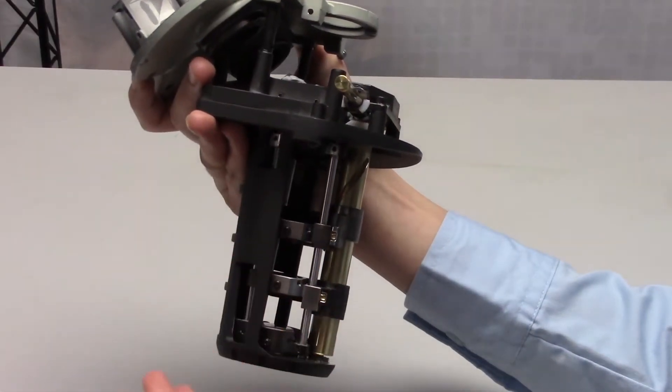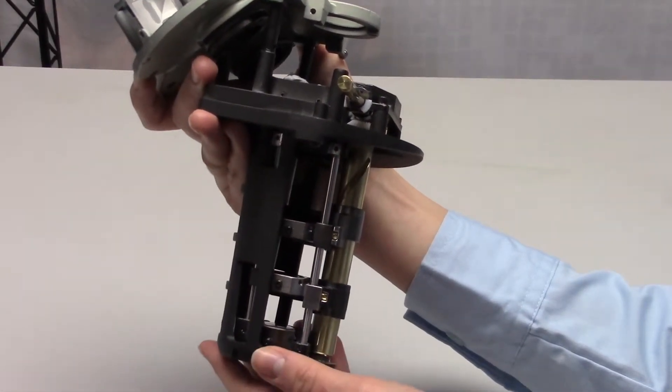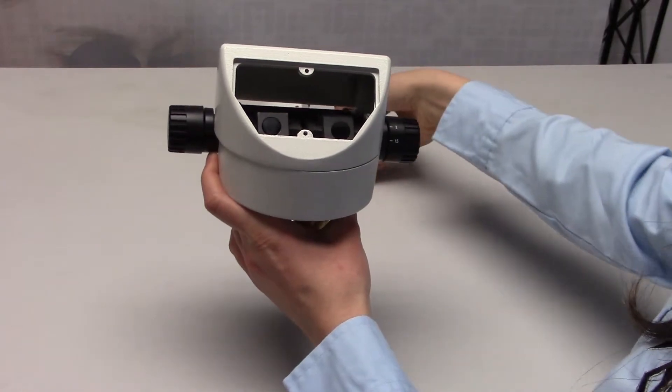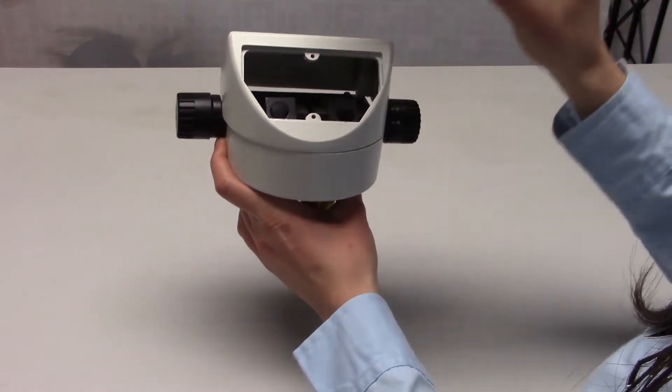One of the important features of a well-built microscope is lens alignment. It is important that all the lenses and prisms in the system stay in proper alignment to prevent double vision. That is why the Avon Carton microscope is built with a single frame, ensuring proper alignment of all the parts over the life of a microscope. Many of the cut-rate scopes are built from stock parts from various factories and are assembled in three or more pieces, which risks misalignment as lenses and prisms can move in manufacturing and everyday use.